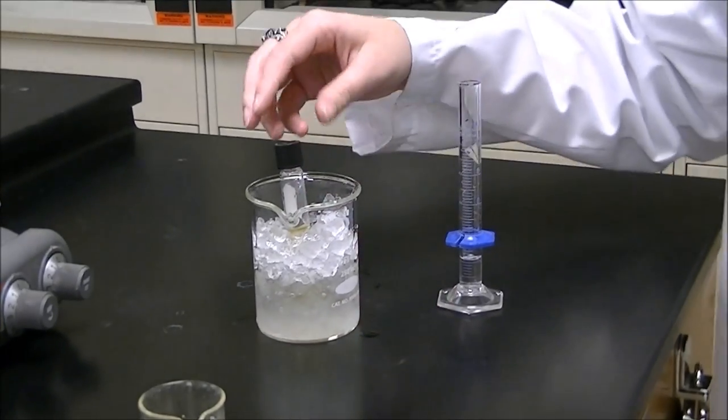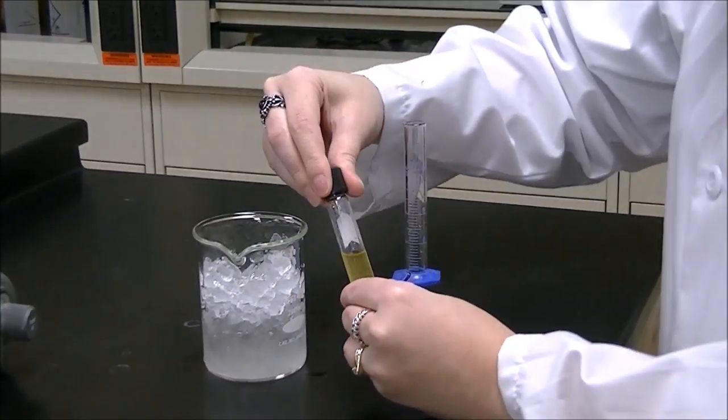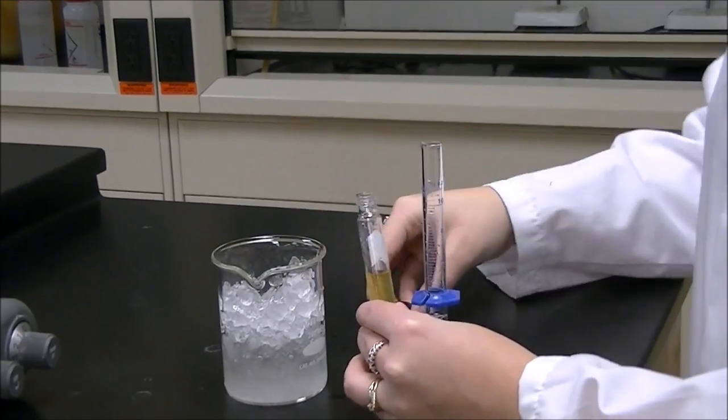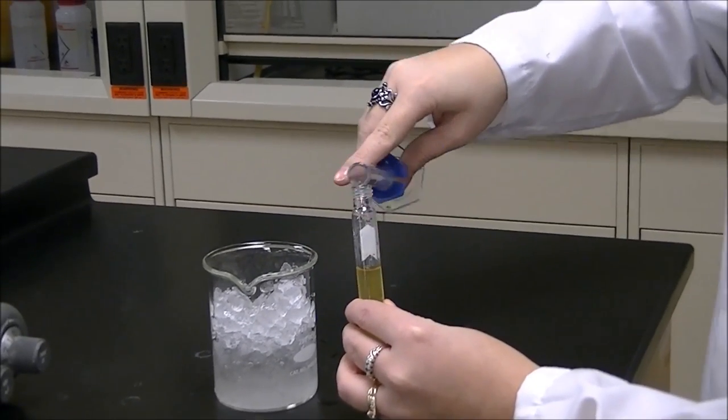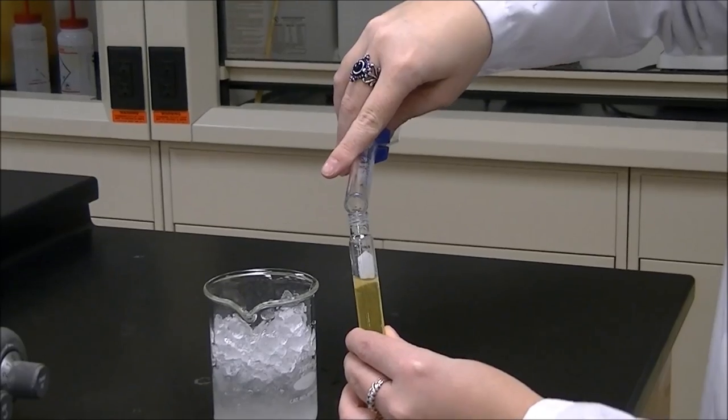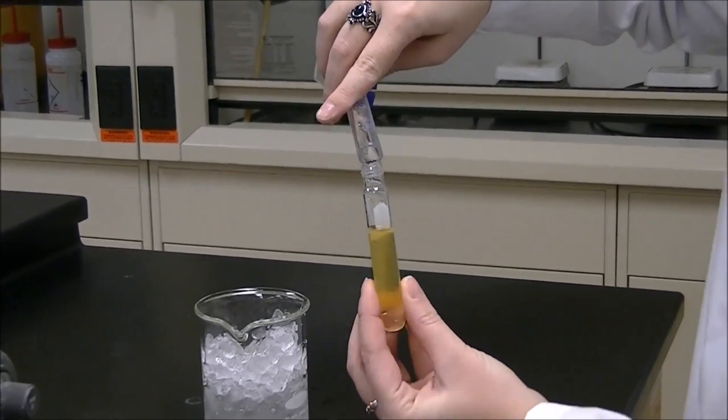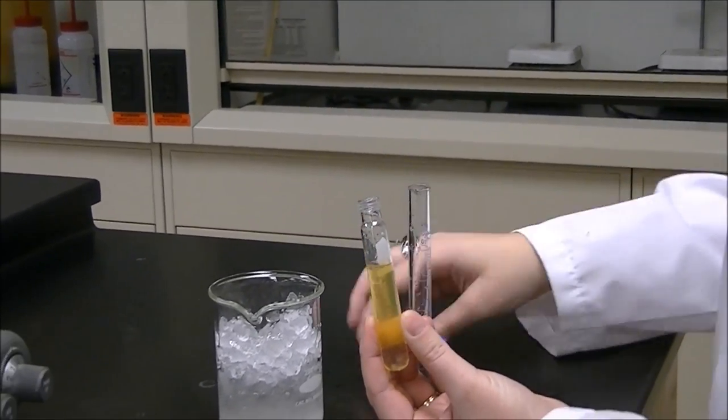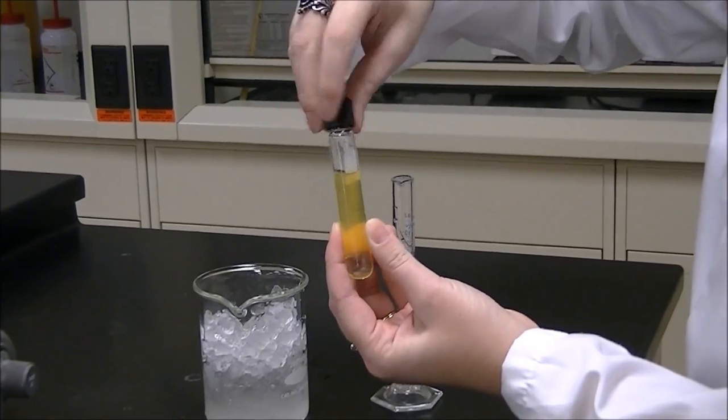After the centrifuge tube has cooled for three minutes, you're going to put 2 milliliters of methylene chloride into the centrifuge tube. This is where the extraction is going to occur as you invert the centrifuge tube several times.